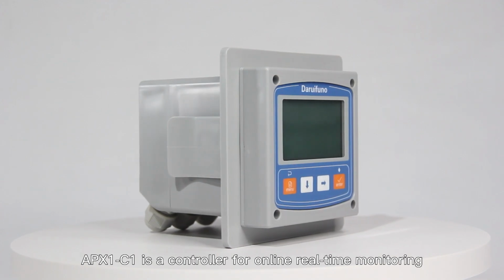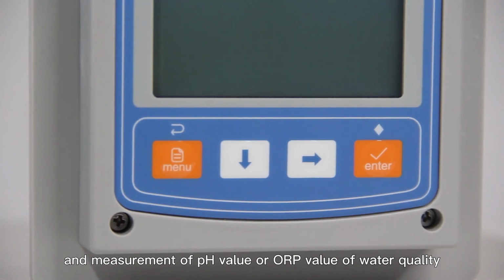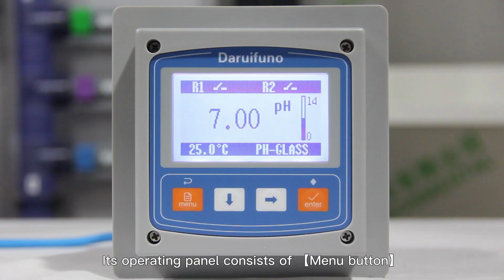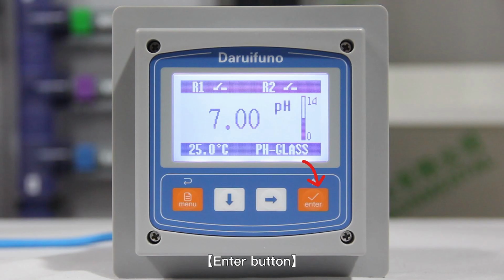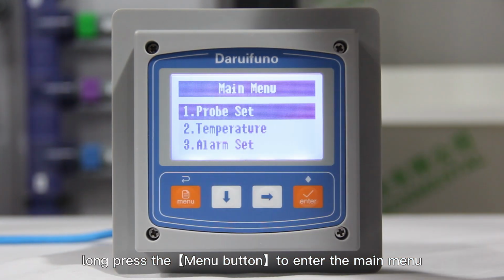APX1C1 is a controller for online real-time monitoring and measurement of pH value or ORP value of water quality. Its operating panel consists of menu button, down button, right button, enter button and a display screen. In the measurement mode, long press the menu button to enter the main menu.